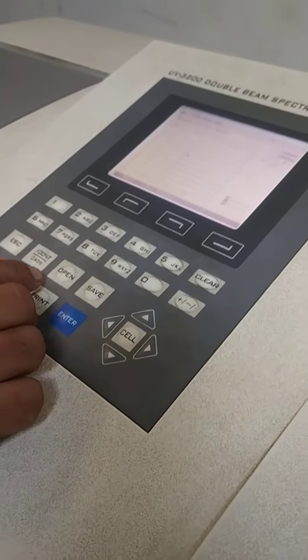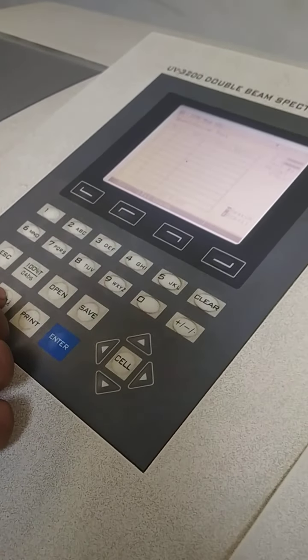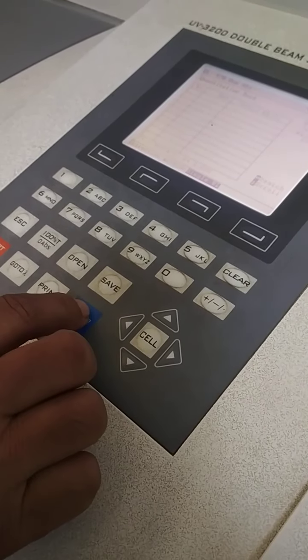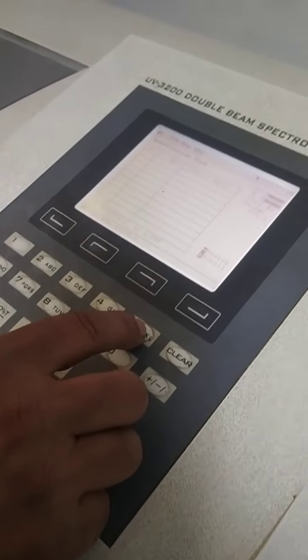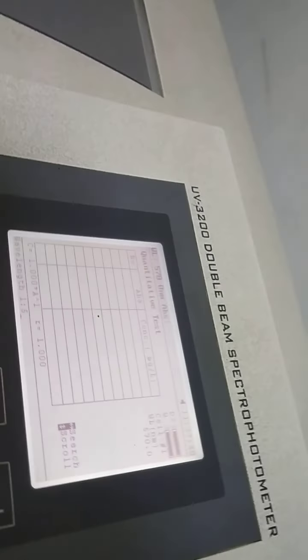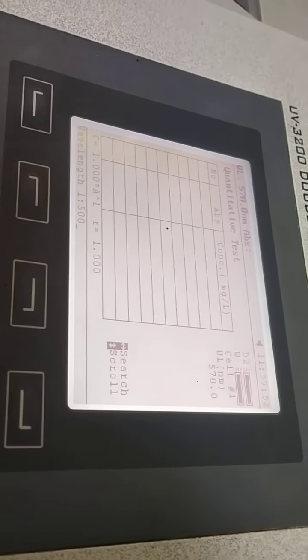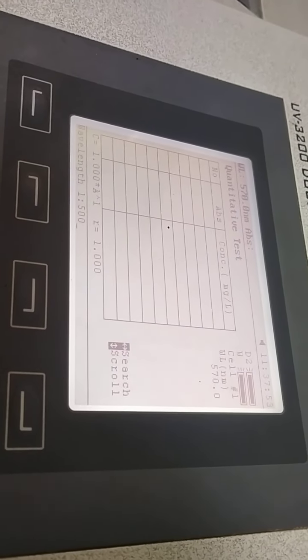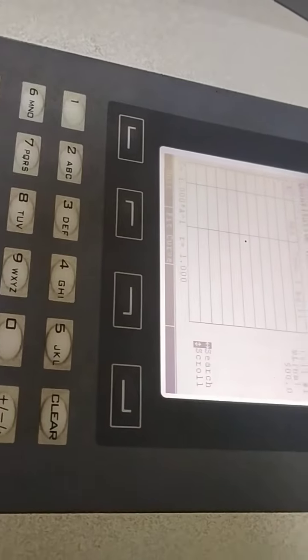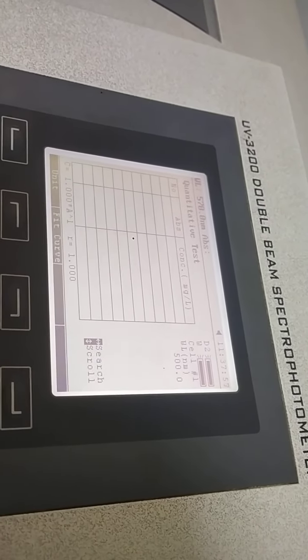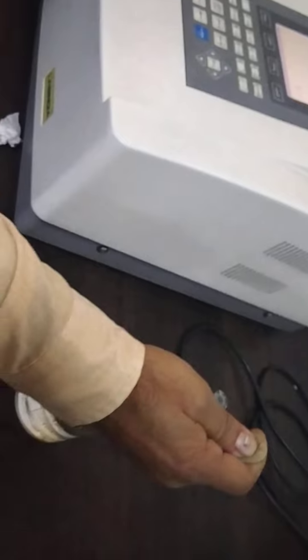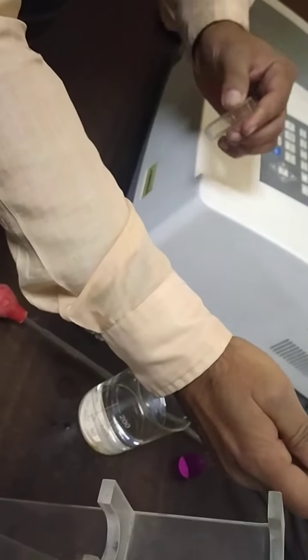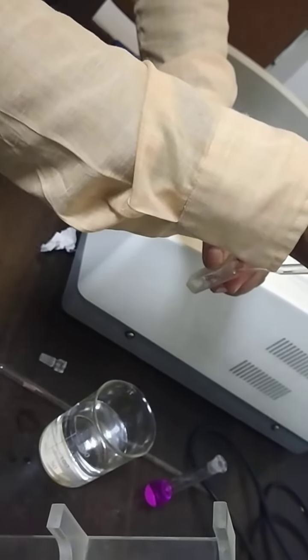We have set go to lambda in single wavelength. Now we will start to 500. I have set 500, now we will perform.